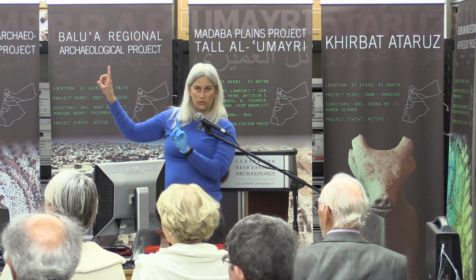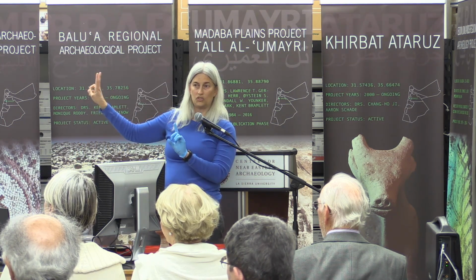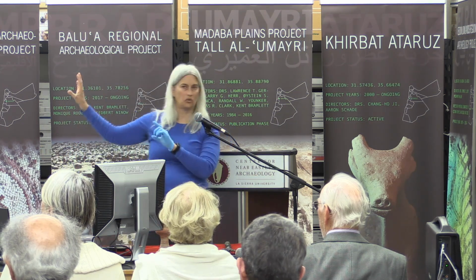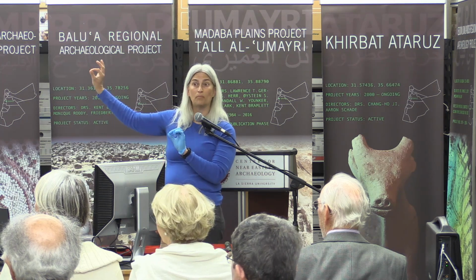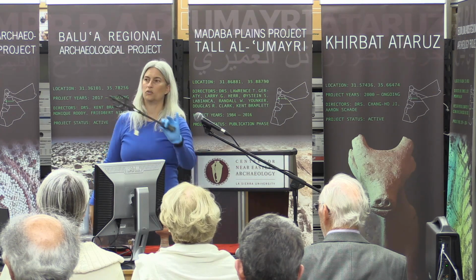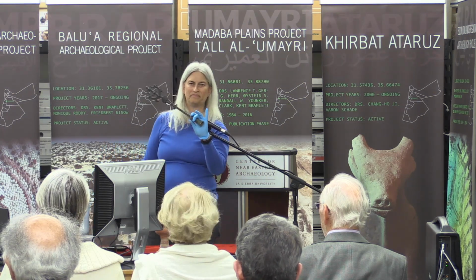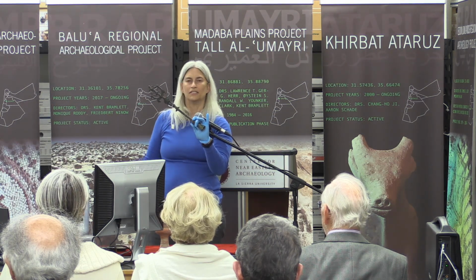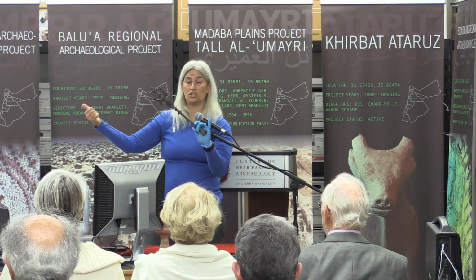Now you can see that both of those lines line up. So what element is that? Oh, we can't quite see it. It's a really small one. Copper. Okay. So when you look at this, do you think copper? No. What do you expect copper to be? Nice and shiny when it's new.